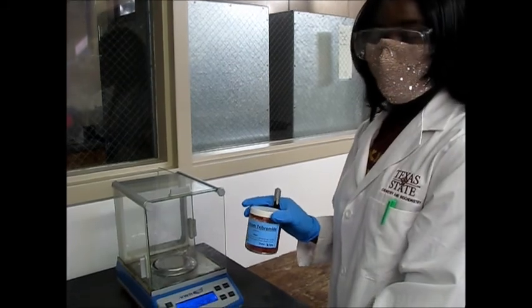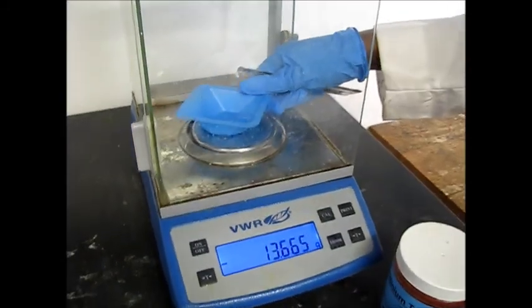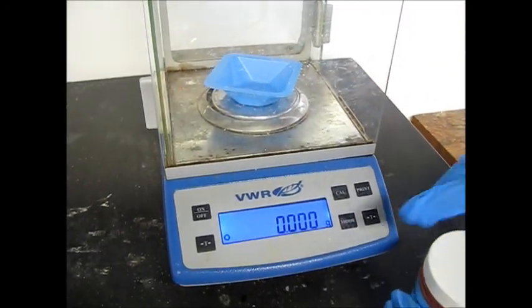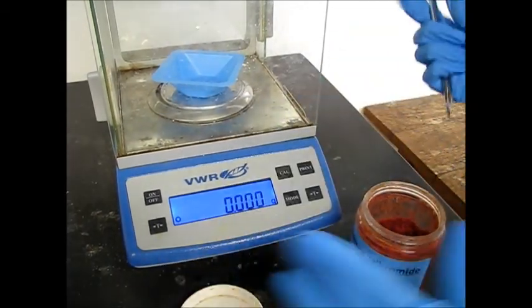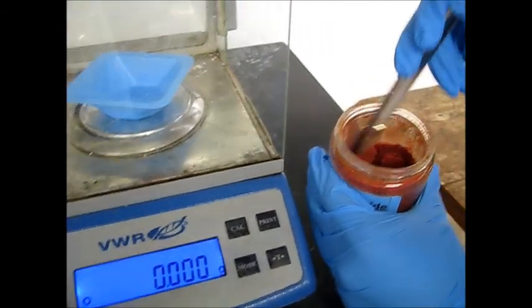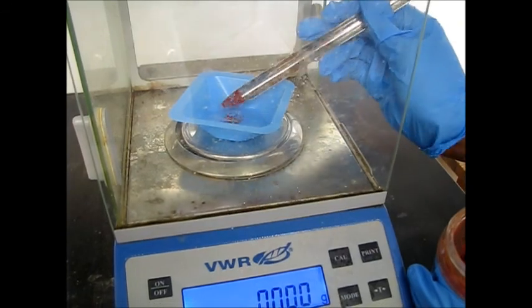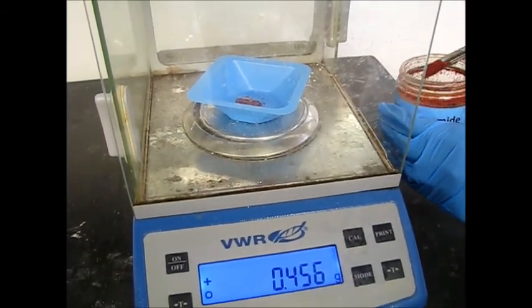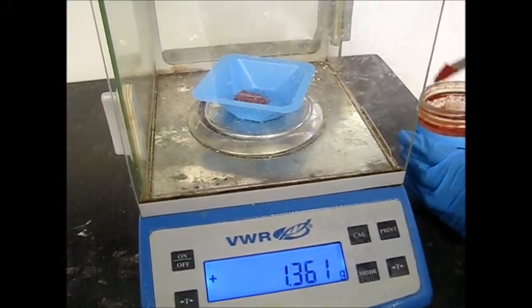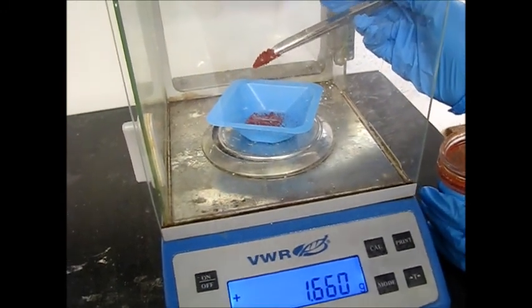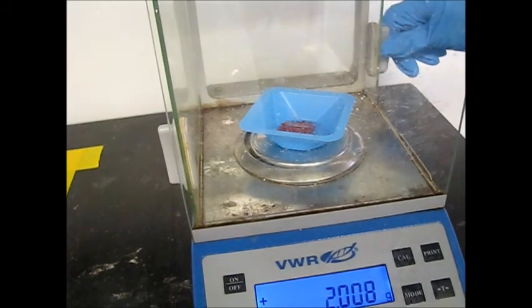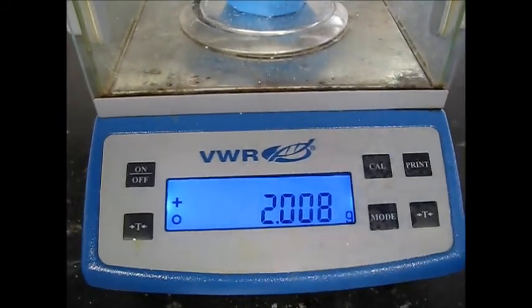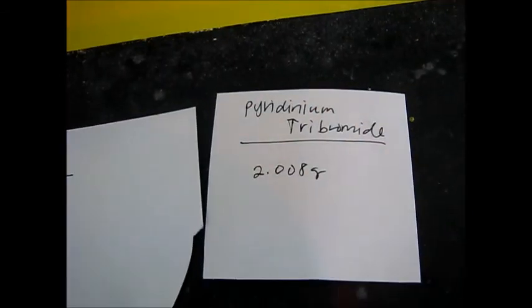Next we're going to weigh out our pyridinium tribromide. Going to get my weigh boat, put it on the scale, zero it out. I'm going to get my correct spatula. This is red. I'm getting two grams. 2.008 grams. So here we note down the stilbene 1.064 grams and pyridinium tribromide 2.008 grams.